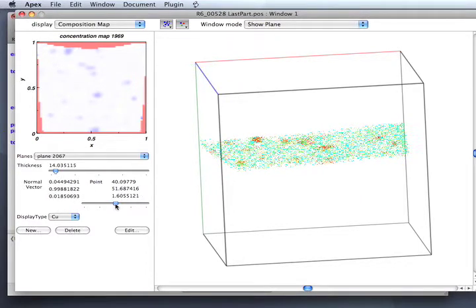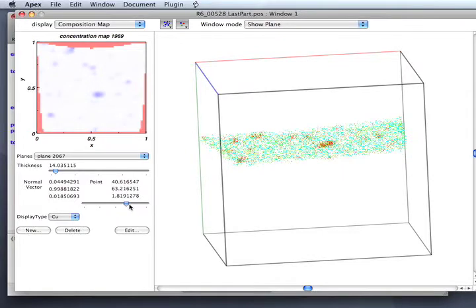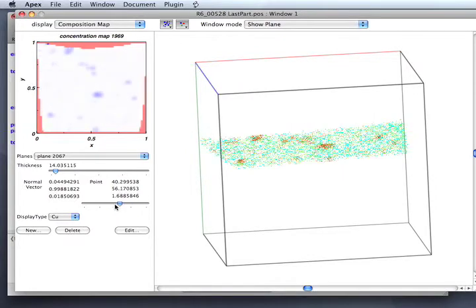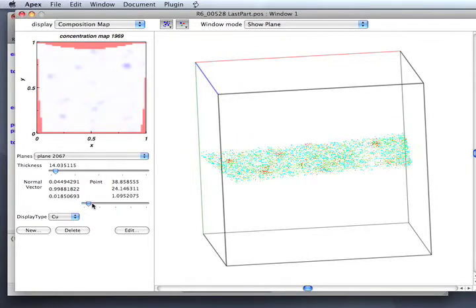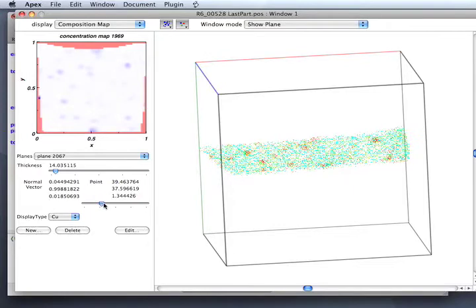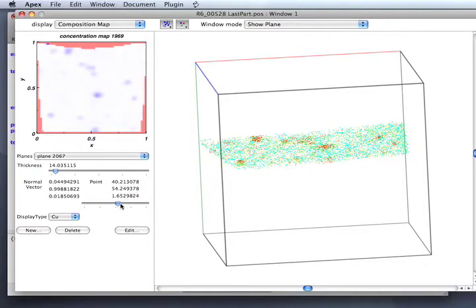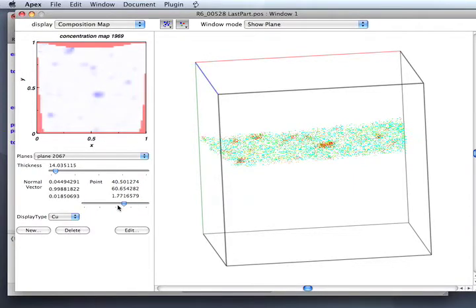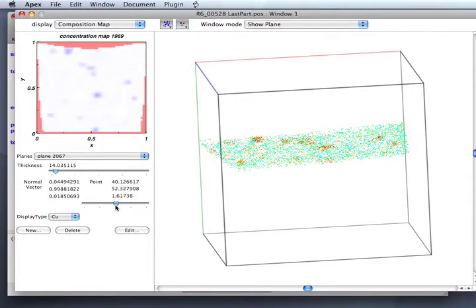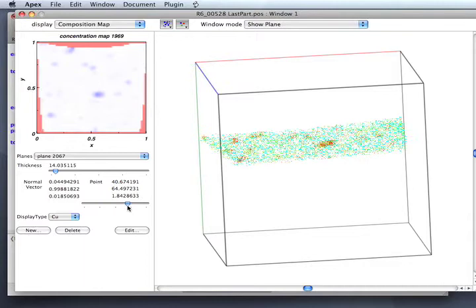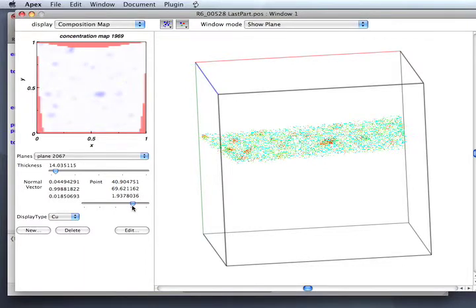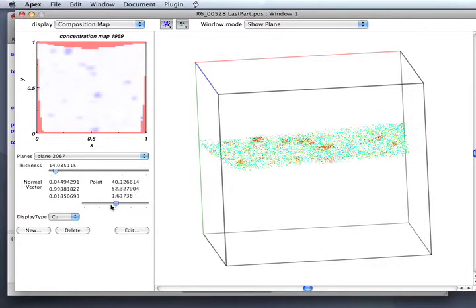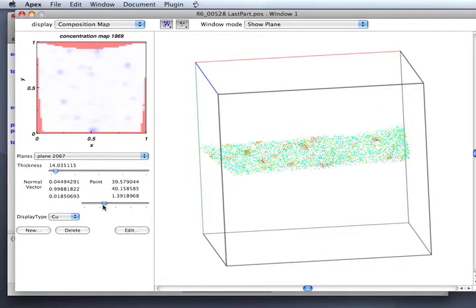Then this slider moves the plane up and down. You can really get a sense of how the precipitates are distributed in the plane as you go up and down. The planes are defined by having a point in the plane. You can see that point in the plane—the numbers right above the slider are changing as we move up and down. The normal vector stays the same.